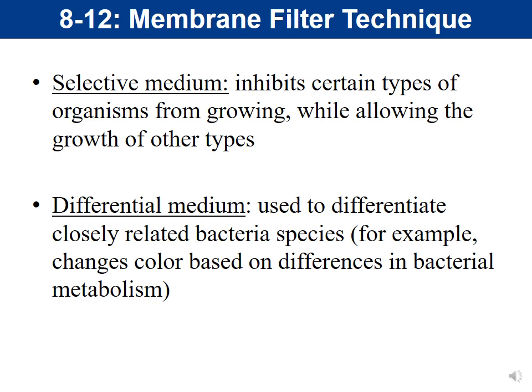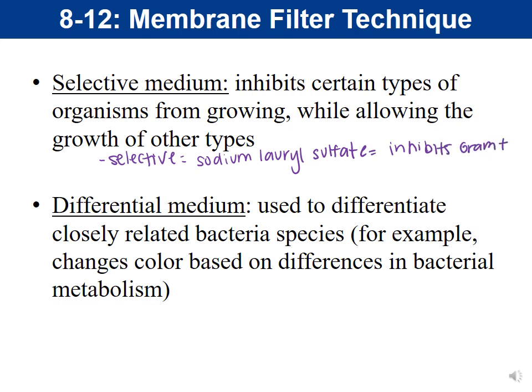So in our example for LTB, our selective ingredient is our sodium lauryl sulfate, because it inhibits gram-positive but allows gram-negative growth.